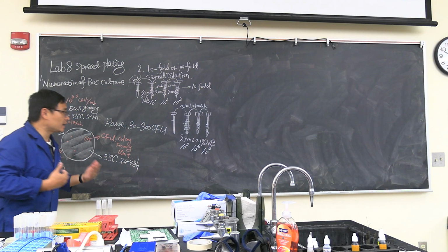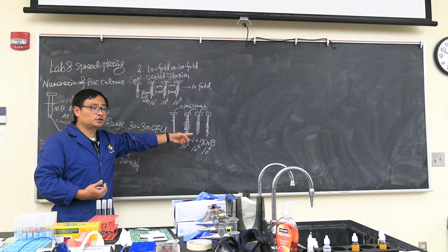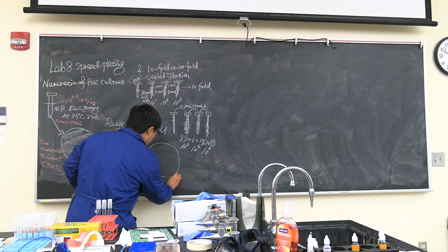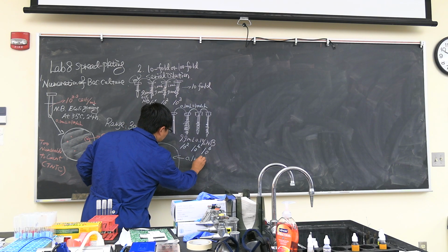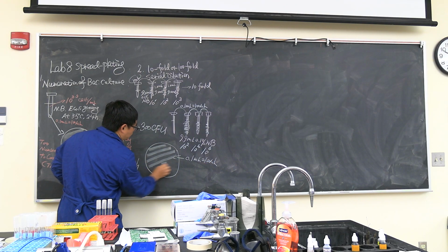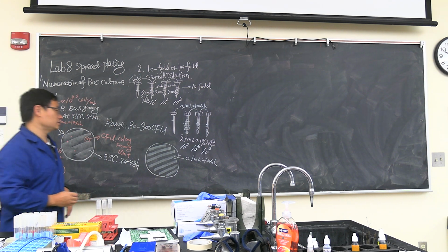Finally, after dilution, we usually use these diluted tubes to do the spread plating onto the agar plates. On the agar plates, we usually add 0.1 ml, which means 100 microliters. Using a spreader, do a very good job of the spread, gentle, but evenly covering the surface.